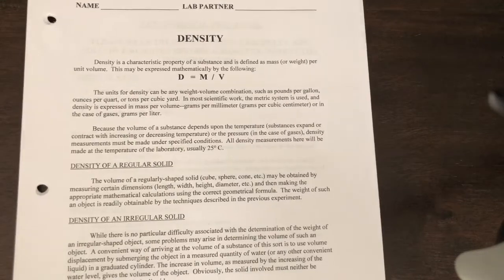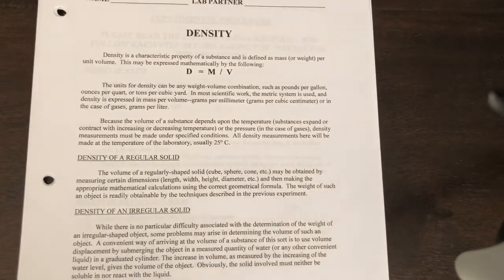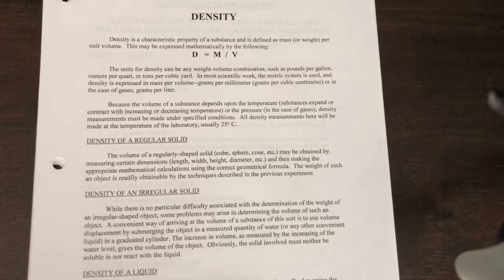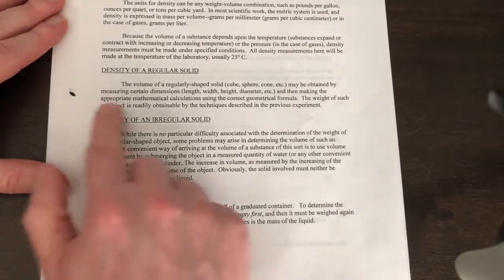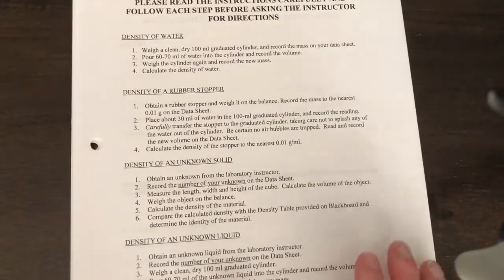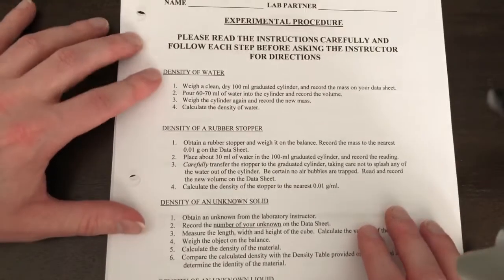So we're going to go through a few different techniques to find densities of liquids, densities of unknown solids, and finding the density of an irregular shaped object, okay? As you read through the lab, make sure you read this for each section that we're going to be dealing with. The first section, in the first part of the lab, is finding the density of water.